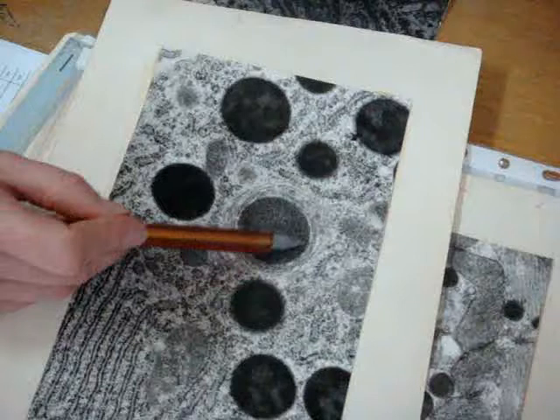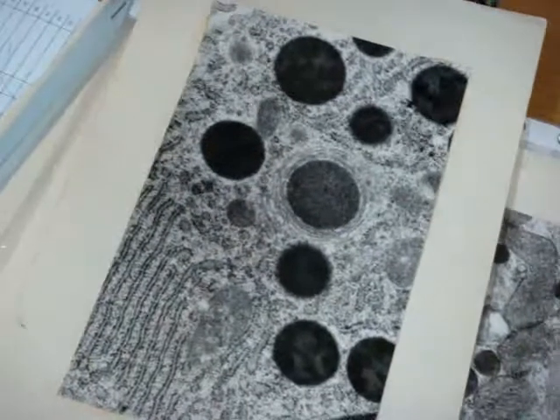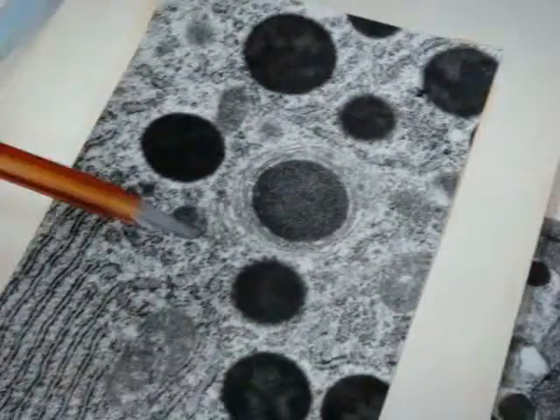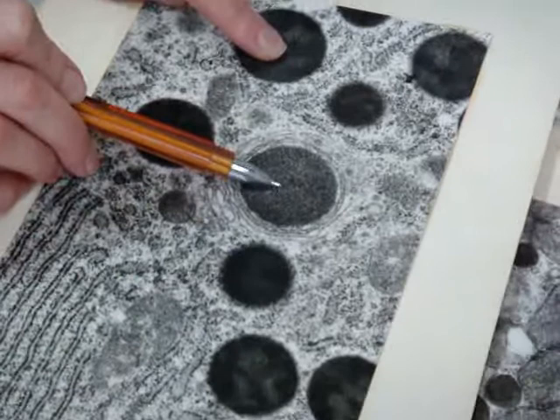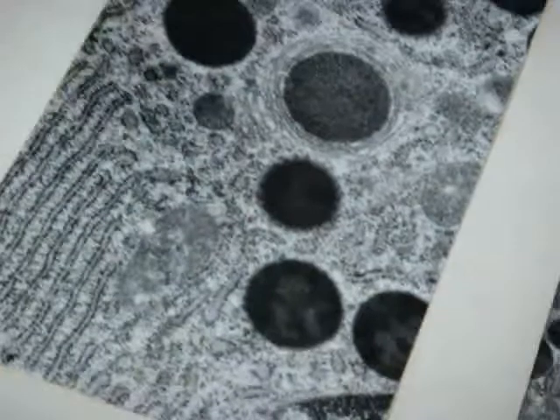And look please, we can see around one of the granules a lot of membrane. Actually it's maybe the Golgi apparatus surrounding these granules. These are more dark than these, yes? These are mature granules that are going to leave the Golgi apparatus. This is what? Nucleus. Yeah.